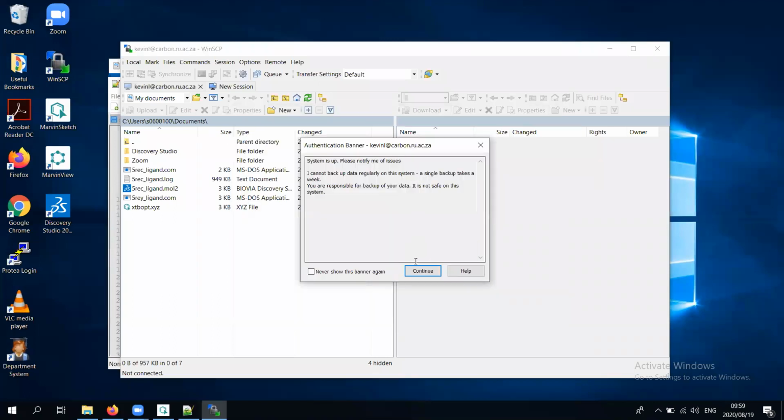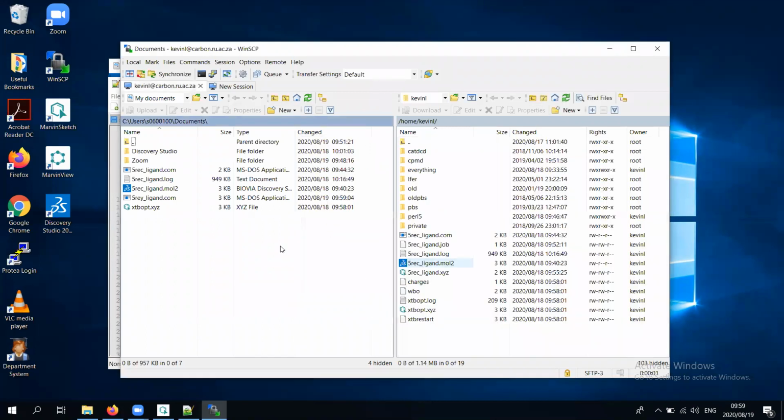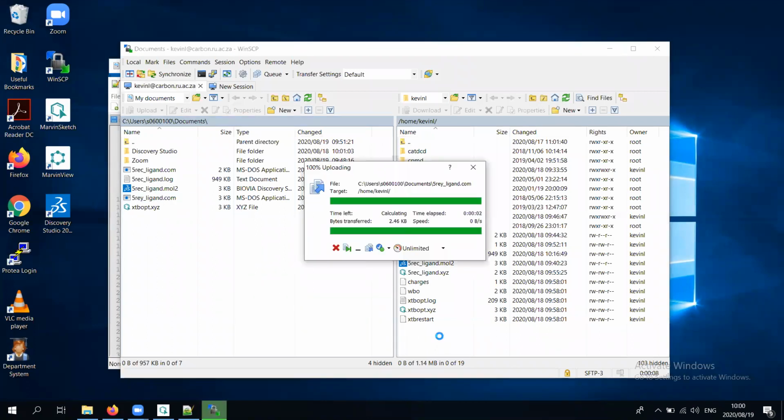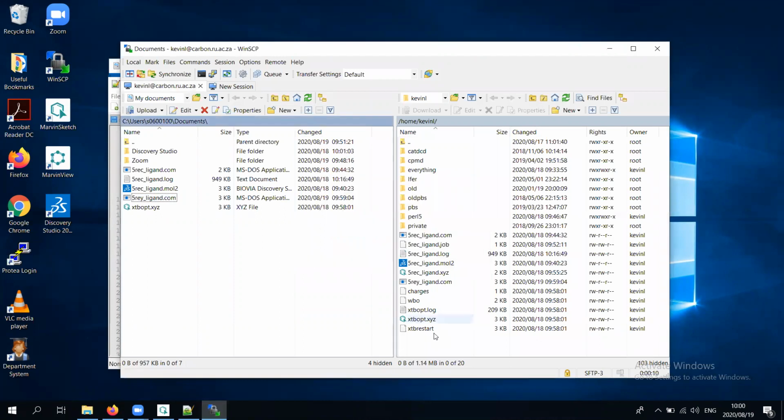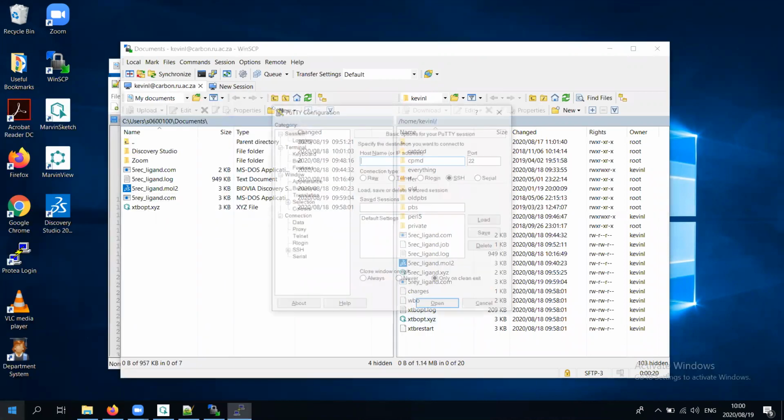Okay, so here we go. Let's copy that. So it's 5REY. I'm going to copy it onto the cluster. Okay, and so now I have 5REY ready on the cluster. So I'm going to need PuTTY. There's PuTTY.